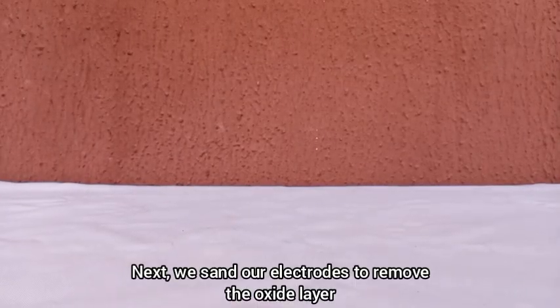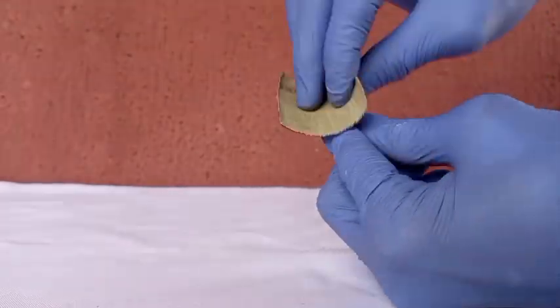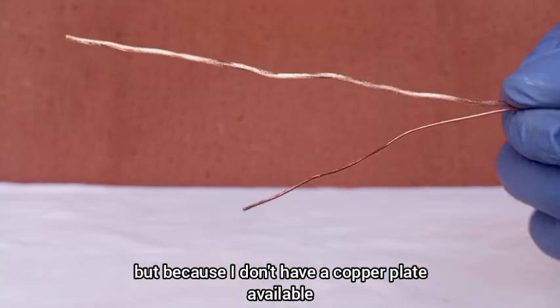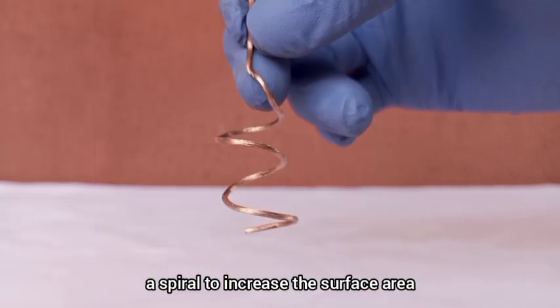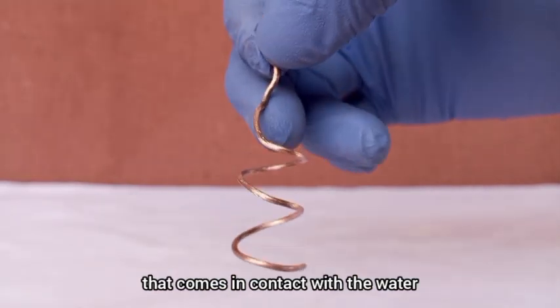Next, we sand our electrodes to remove the oxide layer that has formed on them. Using a copper plate would be better for the anode as it has increased surface area, but because I don't have a copper plate available, I twisted one of my copper electrodes into a spiral to increase the surface area that comes in contact with the water.